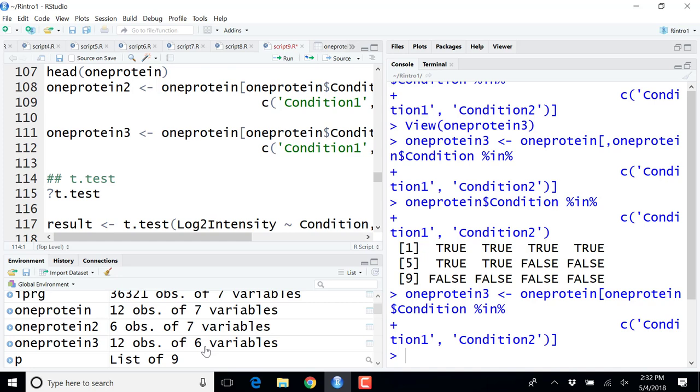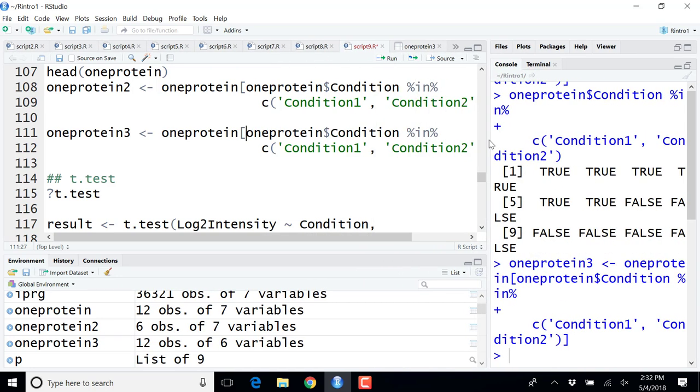Yeah. So it doesn't record any vectors. I mean, if you put the comma here, that is missing, but here we don't have any true for how they define the only column. Yeah, I think here they just look at the only column first. Yeah, that's really. Okay, so let's try to find the solution later.